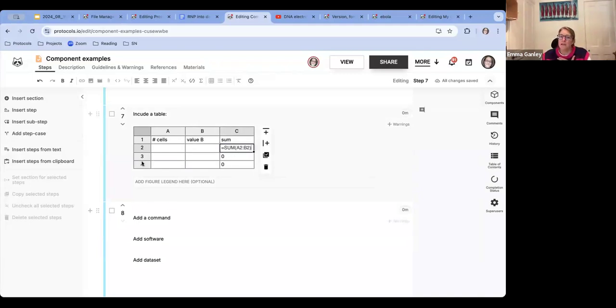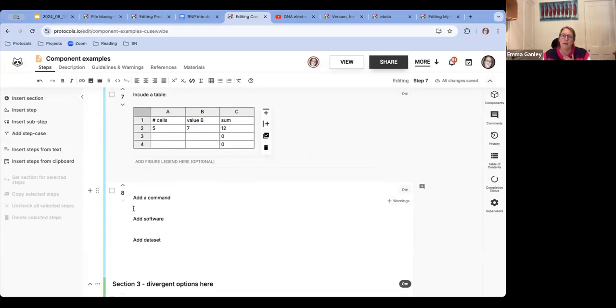And if you're completing the table when you do a run through, it will calculate that for you. So in this instance, let's say I'm putting some in now, it's calculating, and I'll show you in just a second. If you run that, you can complete that when you go through and run as well.